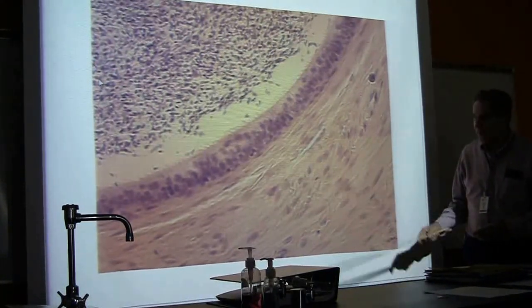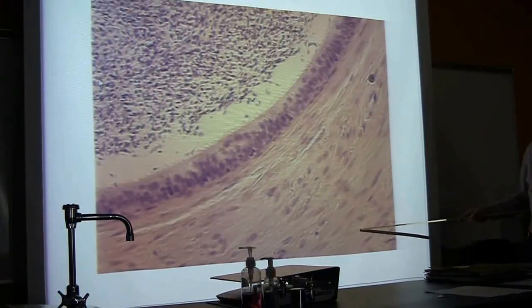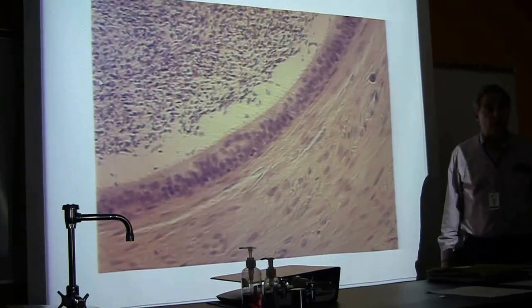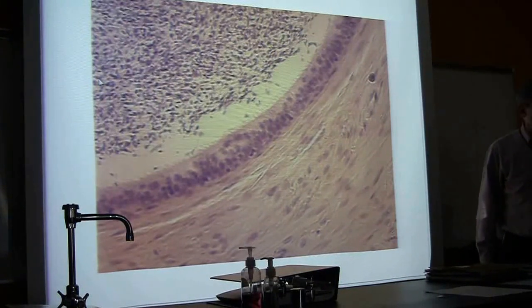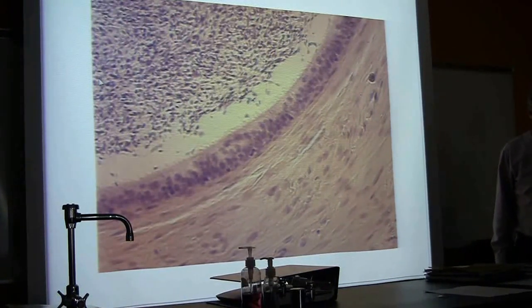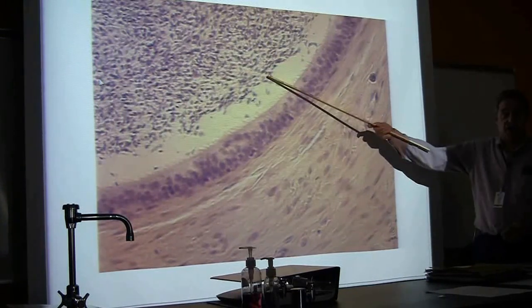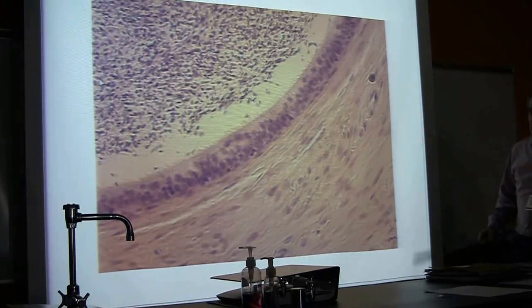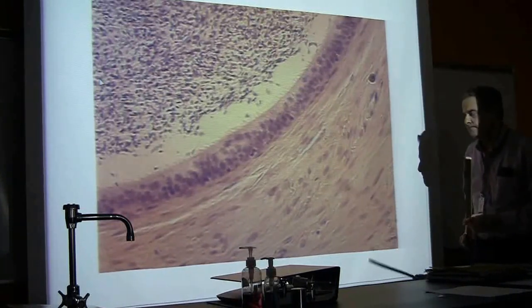What moves the sperm? They're not swimming at this point. Contraction of the smooth muscle in the wall of these tubes moves them. Now the sperm are temporarily stored here. What else occurs in the epididymis? Maturation. When the sperm leave the testes where they're produced, they're not capable of fertilizing an egg. They are not mature yet. The maturation process occurs here. And usually they don't start swimming until they're released from the body of the male, saving their strength, if you will. They're moved along passively by muscle contraction in these tubes.